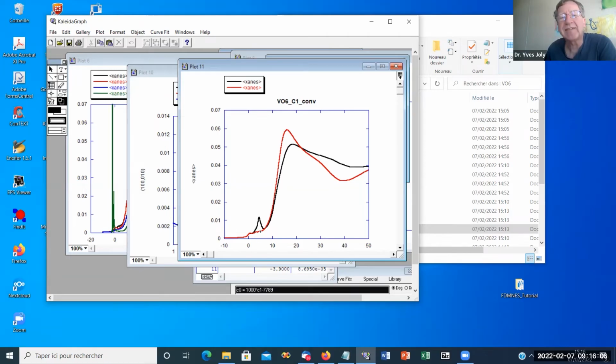You remember that at this energy, you had the pre-edge quadrupolar, so the one probing the D state. So here you have D state. And because you lose the center of symmetry, now you can make a hybridization between P and this state, that is odd and even state. And due to this fact, p states are quantitatively more present at this energy because they can hybridize with the d states which are close to the Fermi level.